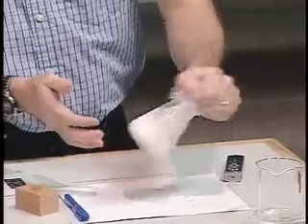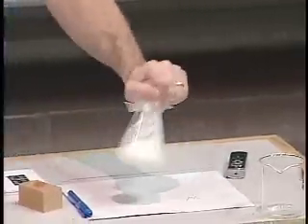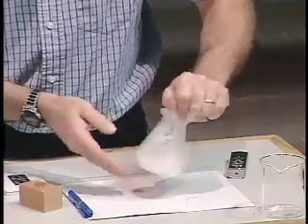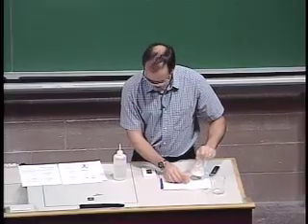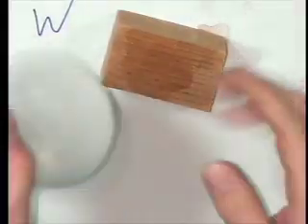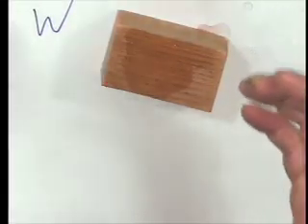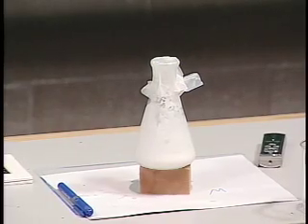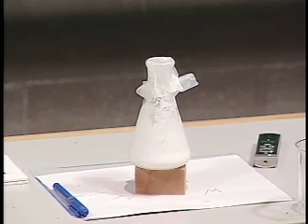As this reaction proceeds, remember that we were releasing two moles of ammonia and ten moles of water for every mole of barium hydroxide—very endothermic. I've got this little block of wood here with some water on it. I'm going to show you how endothermic it is. That's all mixed up. It's a nice slurry now because all that water has been released, and I'm going to stick it on that block. I can show you just how endothermic this reaction really is.